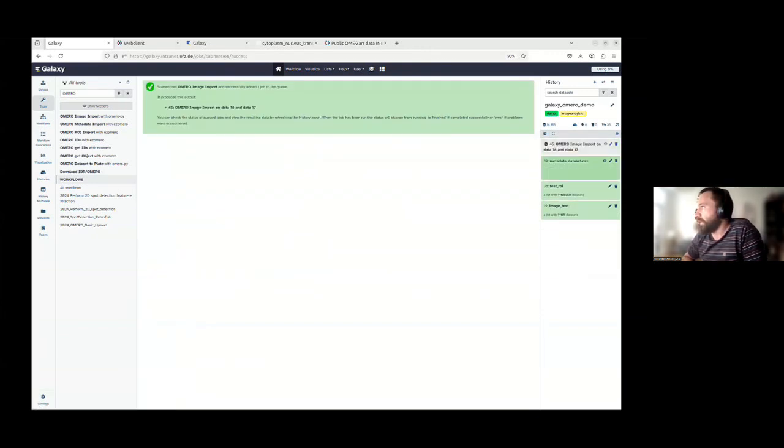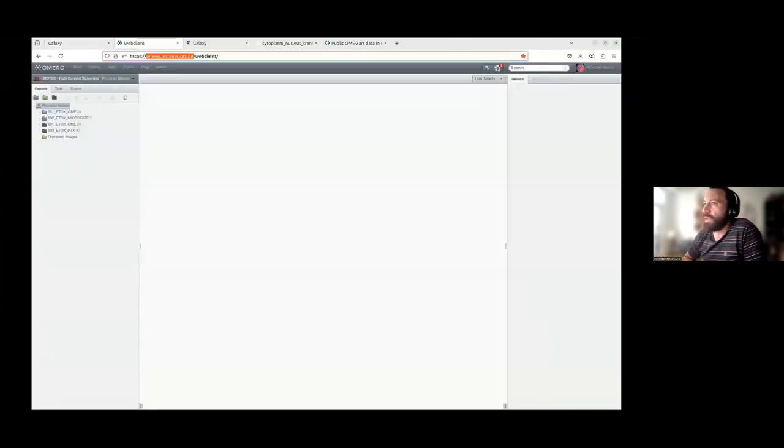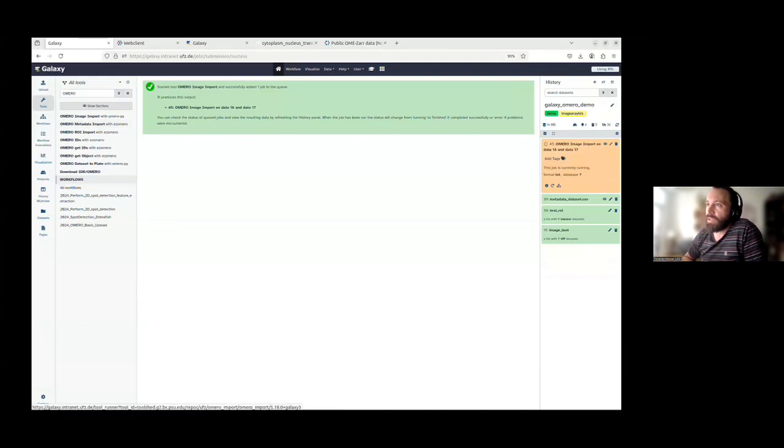And on the right, the tool is queued. So it's gray, now it's yellow. So it means that it's starting. And now in the next step, this will be uploaded into Omero. So these are the different Omero tools that we have at the moment. Uploading is just taking some time for the connection to Omero. If you have more images, this will not take more time.